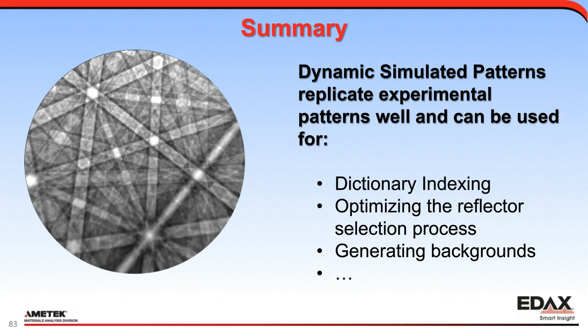And this is still all, we're just learning. And so I think there'll be new areas in the areas of, say, phase ID, resolving pseudosymmetry problems, and I'm sure other areas that we haven't anticipated yet that will give us some exciting results for the future.